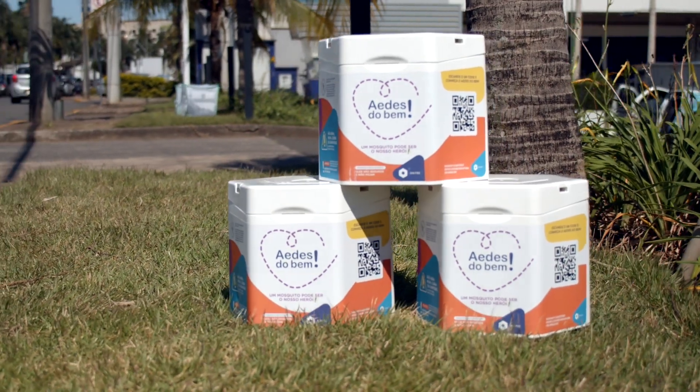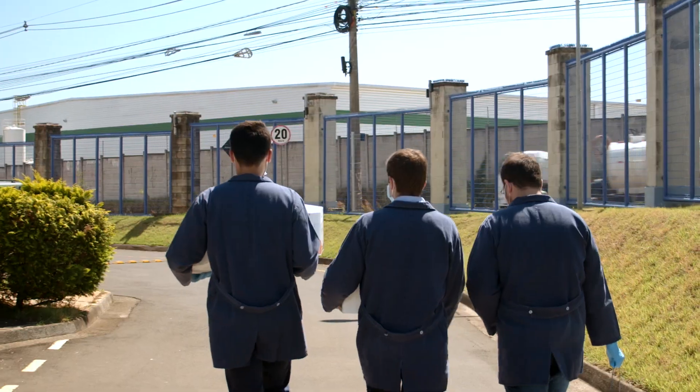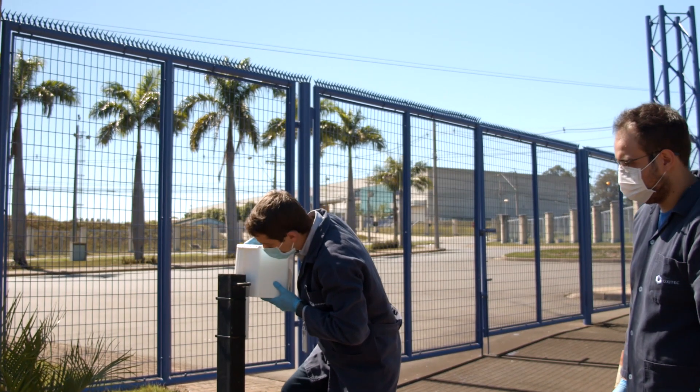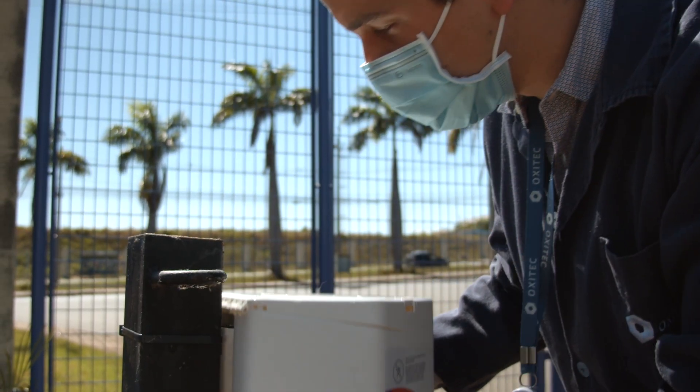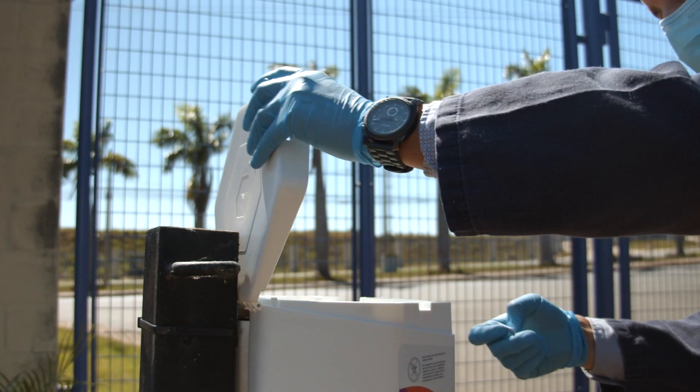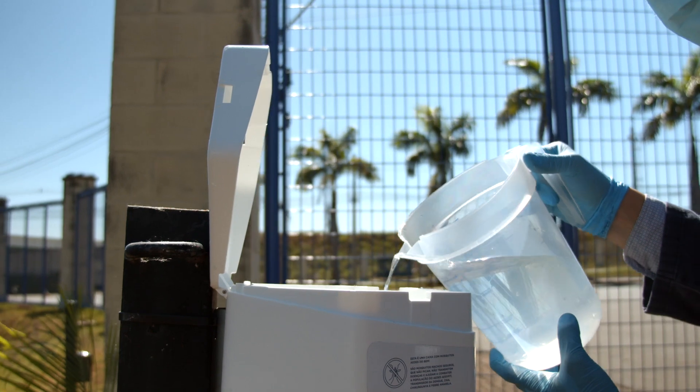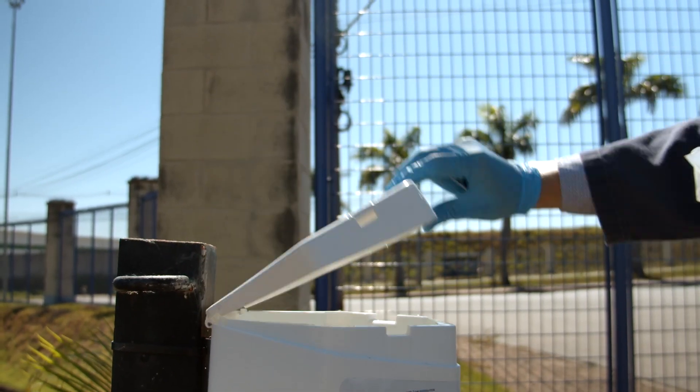This includes larval rearing, monitoring adults, and finally putting the eggs in the boxes ready for field deployment, when our safe, non-biting insects go into the real world. The eggs in boxes are activated in the field with our Just Add Water technology, and they grow into male-only adults and mate with invasive females. The female offspring of these encounters cannot survive.